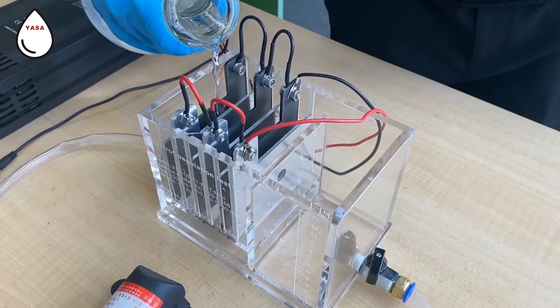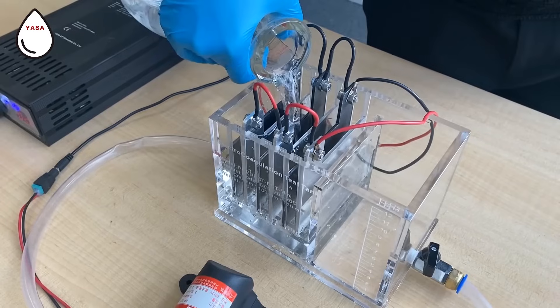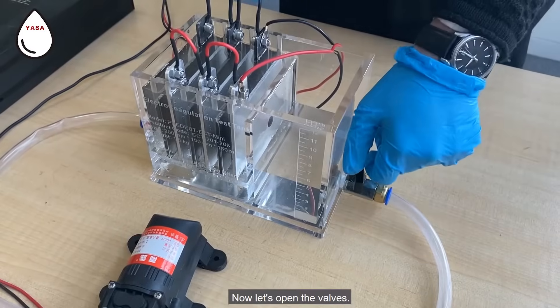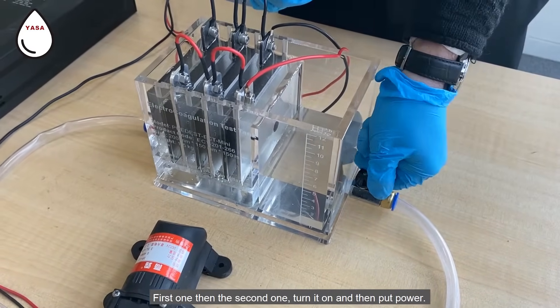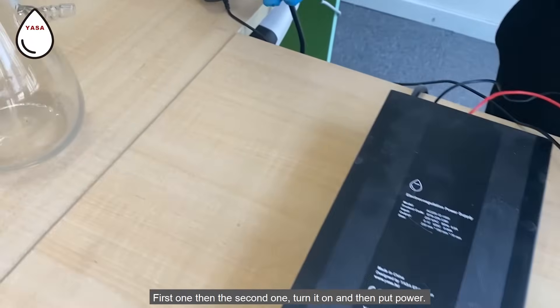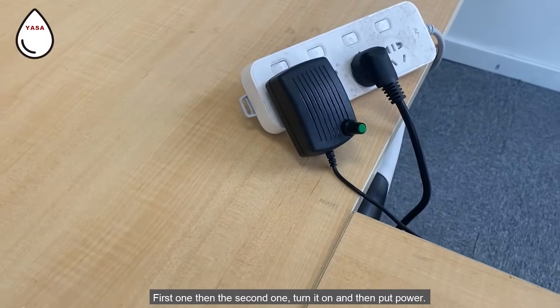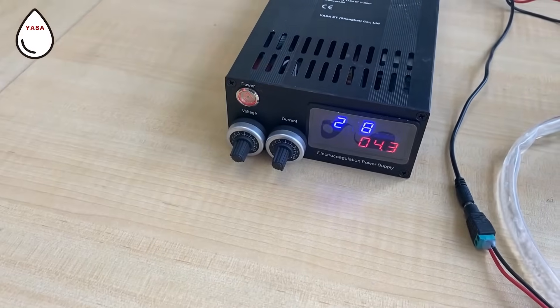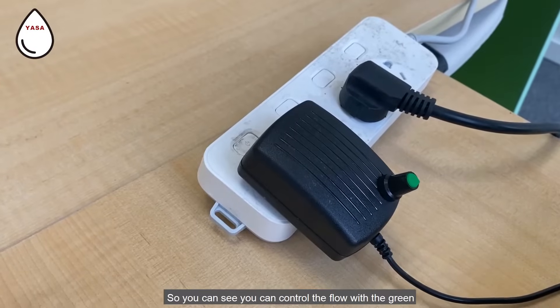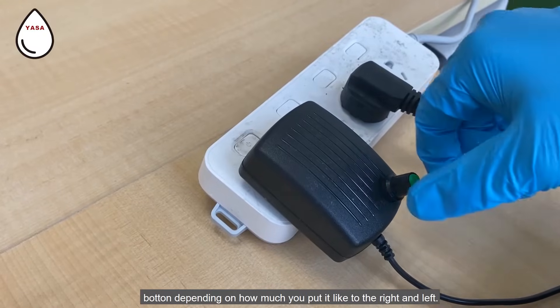Okay, now let's pour water. Now let's open the valves — first one, then the second one. As you can see, you can control the flow with the green button depending on how much you turn it to the right or the left.